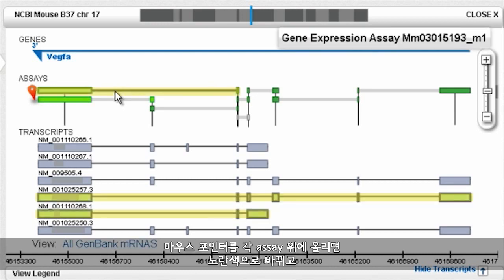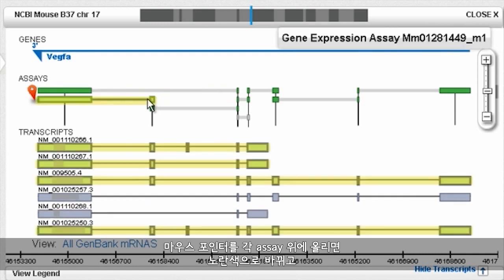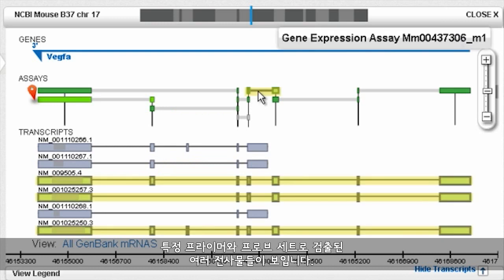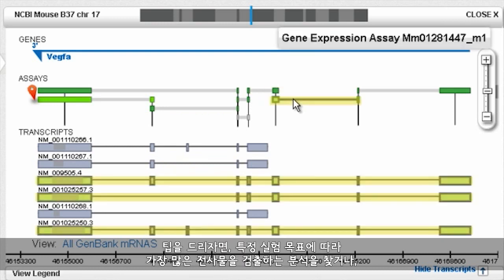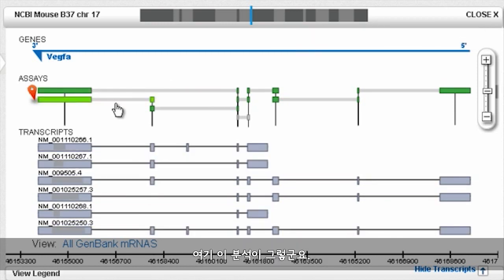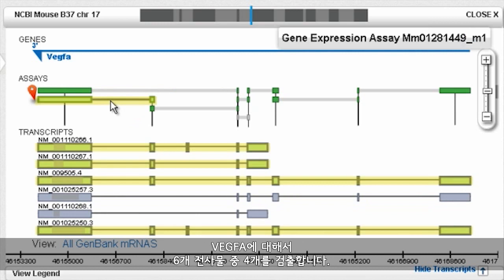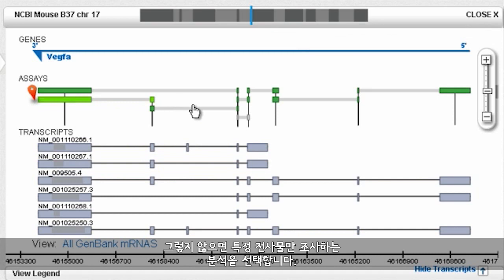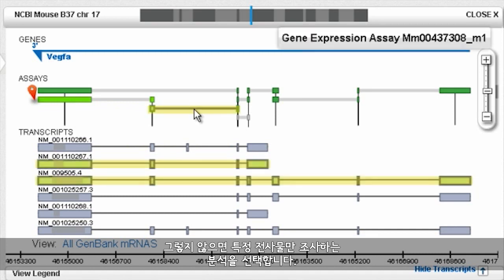Note that as we mouse over each assay, it turns yellow along with the various transcripts detected by that specific primer and probe set. Depending upon the specific goals of our experiment, we'll either want an assay that detects as many known transcripts as possible — for VEGF-A, that's this assay which detects four of the six transcripts — or one that interrogates only specific transcripts.